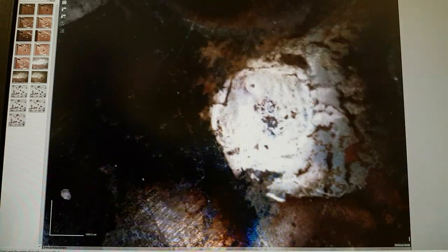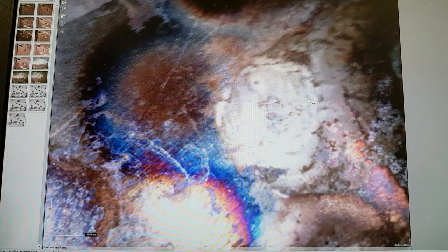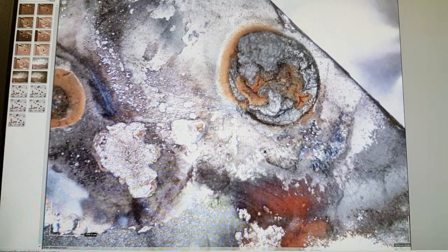I'll do it with less magnification so maybe you can see the two together. When I switch the polarization on, everything else kind of disappears and you just see this hexagonal-type structure. I'm going to flip this over to the other side and bring the normal camera back. I want to show you that you can't really see anything of particular interest — it just looks like some burnt stuff and some slightly affected areas.